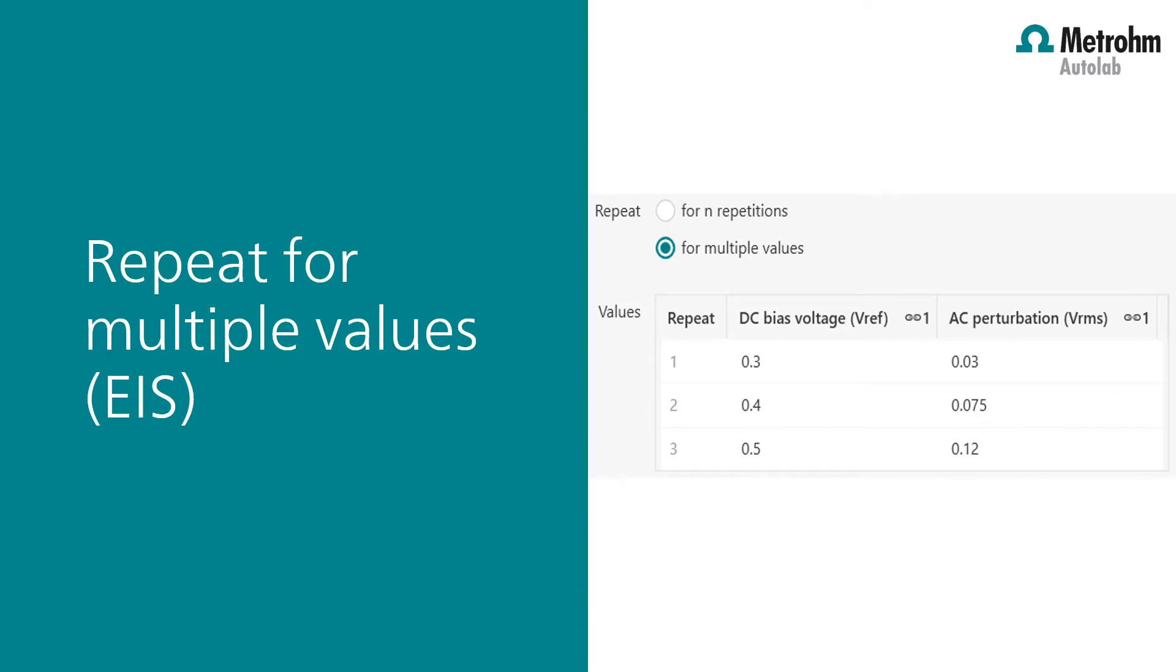In this video I'm going to show you the repeat for multiple values feature which automatically increases the DC bias voltage in the apply settings command and at the same time changes the AC perturbation amplitude in the electrochemical impedance spectroscopy command as shown in the table in this slide.